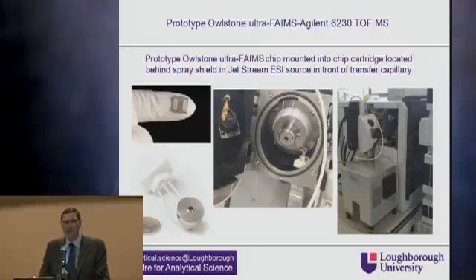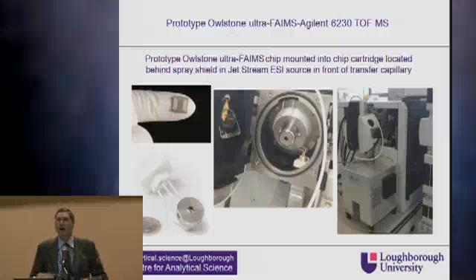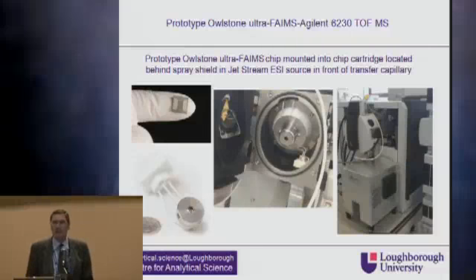But we have both systems in our laboratory. We haven't done any head-to-head comparisons between the two. Life is too short for that. But we have done some measurements on both instruments. And the point I would make is that some of the general issues and points I'm making about what FAIMS might be able to do for you and for us are general to these two electrode geometries, and indeed other configurations as well, although there are individual differences between the various devices.